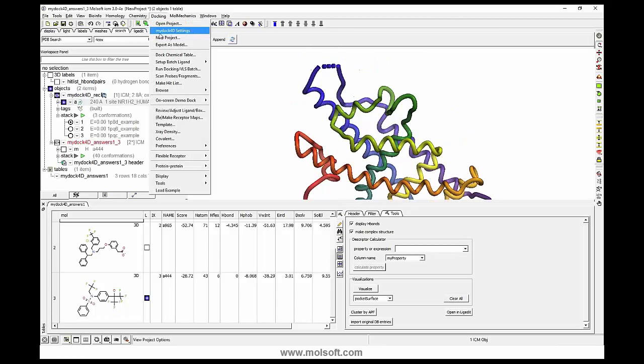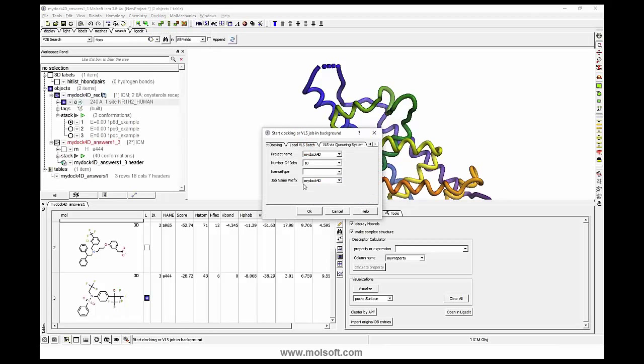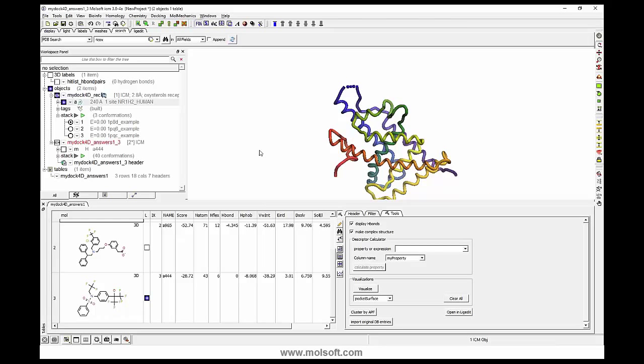When you do docking, run docking batch for here, you would increase the effort to higher because you're docking to a 4D grid, so you'd increase it maybe to 5 or something like that to increase the length of simulation.